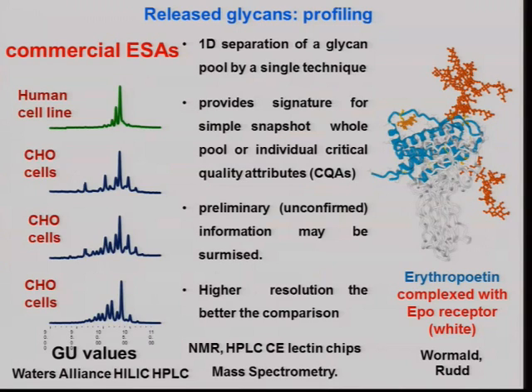So this is what I was saying about, you sometimes just want a quick 1D separation of glycans by a single technique, just to give a signature or a single snapshot in order to be able to compare the glycan profiles of your product with other innovator products.